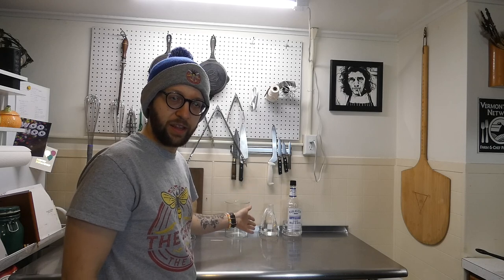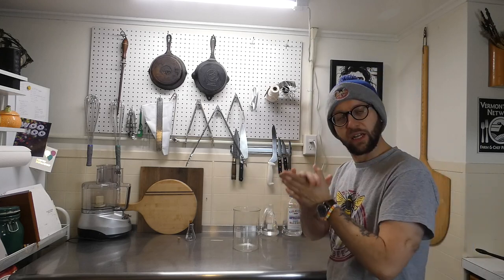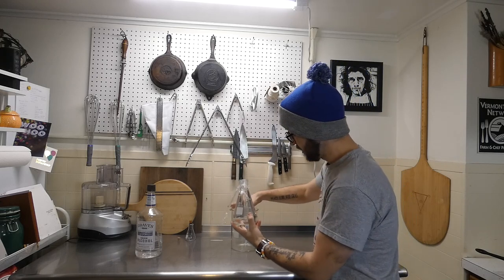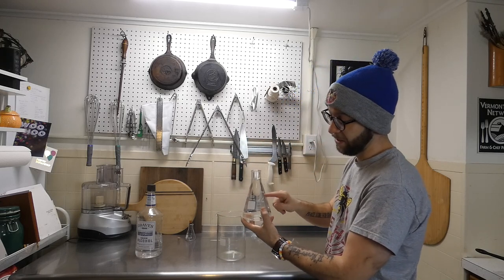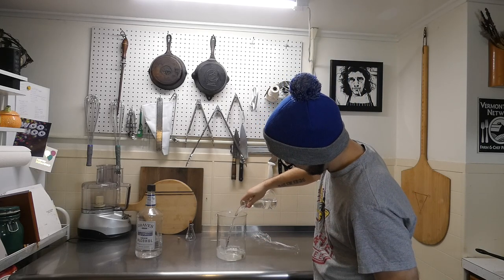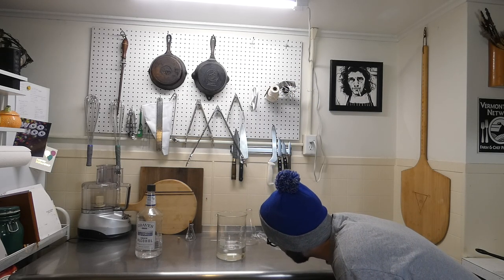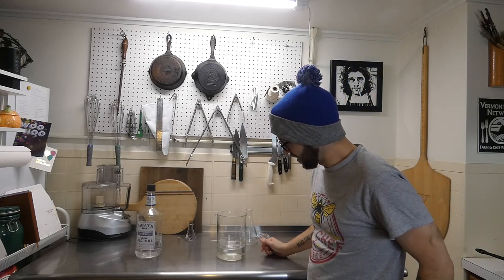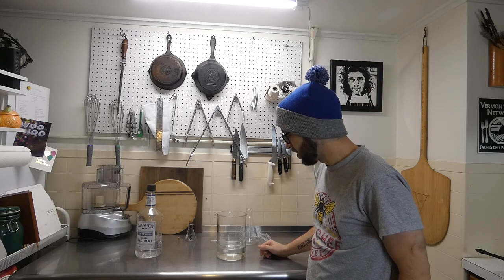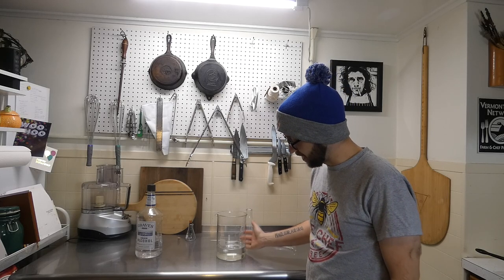I wanna talk about the ethanol that we recovered from the distillation after the extraction. So we used 800 milliliters total of the grain alcohol. This is what we recovered from the distillation, so I'm just gonna pour it in here. I know we have over 500 milliliters. I'm just gonna pour it in here to get a little bit more accurate reading to see how much we lost. Okay, so we have almost 600 milliliters. So we lost a little over 200 milliliters of ethanol. Not quite sure where, but not a huge deal. We recovered quite a lot of it, which is nice because we can just reuse it.